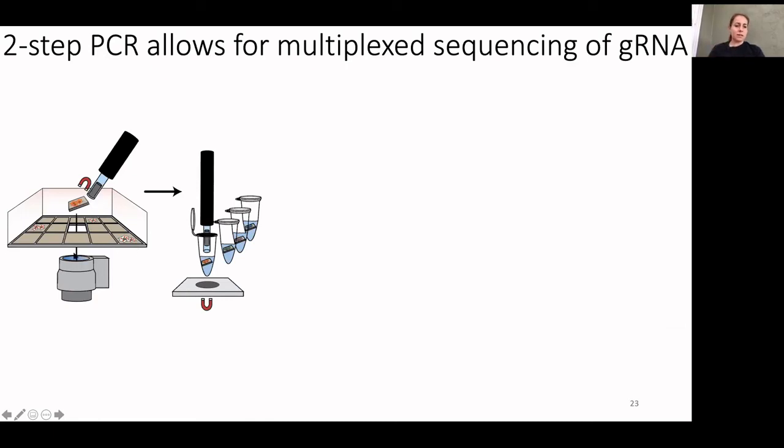I think the needle that goes over the objective, you can buy from Cell Microsystems for, I believe, $1,200, at least that's what it was like 4 or 5 years ago. And this process takes about 1 to 2 minutes of moving the array to the position that you're interested in, poking it out with the needle and picking it up with the micro wand, about 1 to 2 minutes to collect an individual raft in a PCR tube.